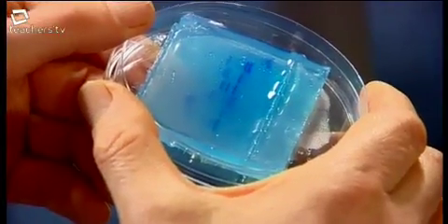Briefly then, tell us what you get and what you do with it. You get 6 samples of DNA, which you're going to cut up with a restriction enzyme, and one of them is from the scene of crime, the other 5 suspects. They can look at this electrophoresis run here, and they can decide who committed the crime. Well, let's see a class of super sleuths in action.